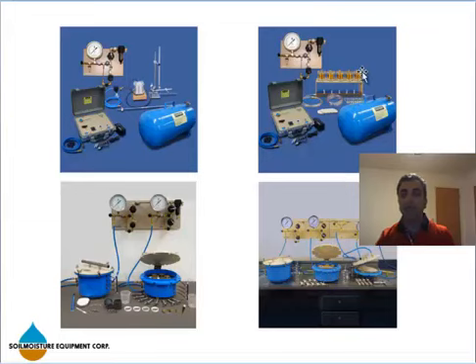The advantage of a Tempe cell is that it is faster in reading, and it's more convenient. It's a very popular method, with a range of application between 0 to 2 bar. You can use it for pressure application or vacuum application.